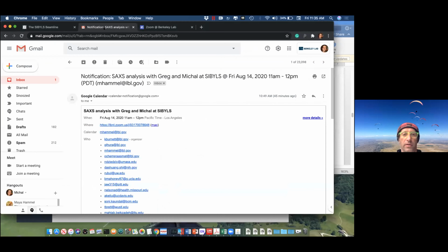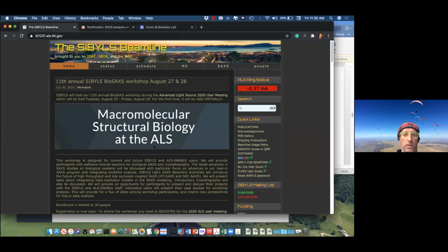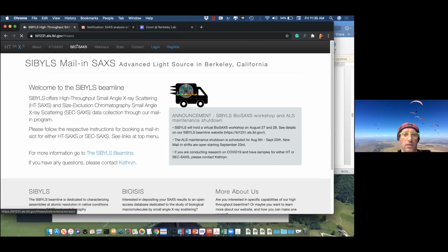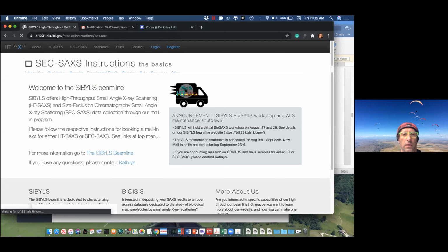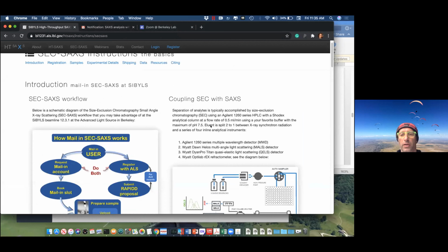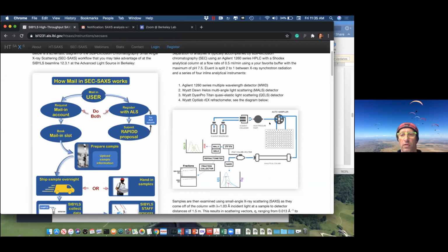Just for those people that never tried, I would just show you what SAXS MALS means to us. On our mail-in page, there is an introduction and instructions. Basically, we have different buffer reservoirs that we can choose, then we have auto samplers and go through the column.